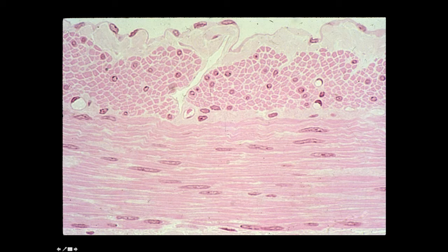In the cross section, I'd like you to keep in mind the size of the smooth muscle cell and the size of the nucleus in relation to that smooth muscle cell.